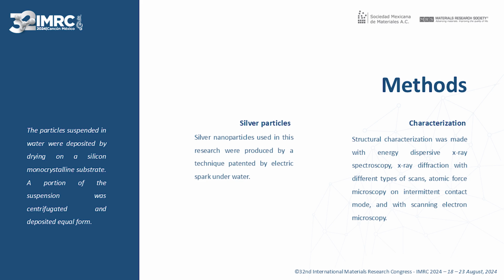The particles suspended in water were deposited by drying on a silicon monocrystalline substrate, and a portion of the suspension was centrifuged and deposited equally. Particles were characterized by energy dispersive X-ray spectroscopy, X-ray diffraction with different types of scans, atomic force microscopy, and scanning electron microscopy.